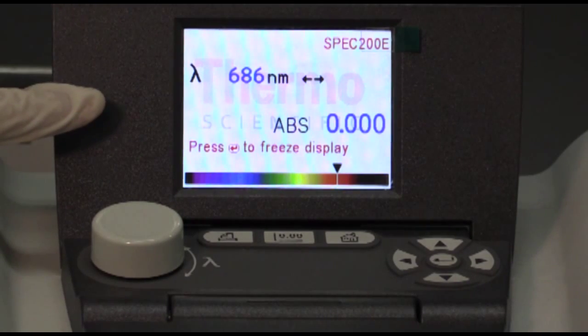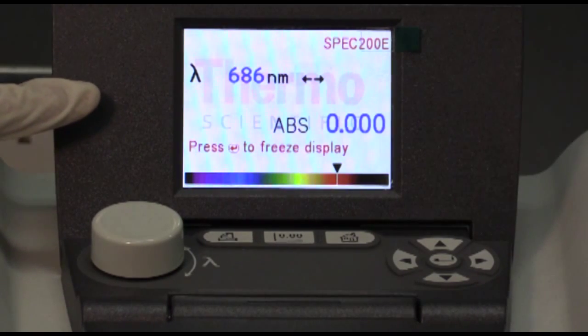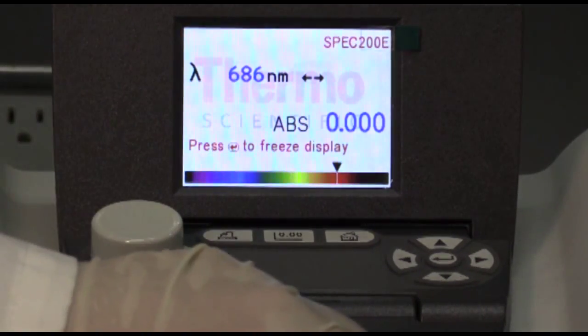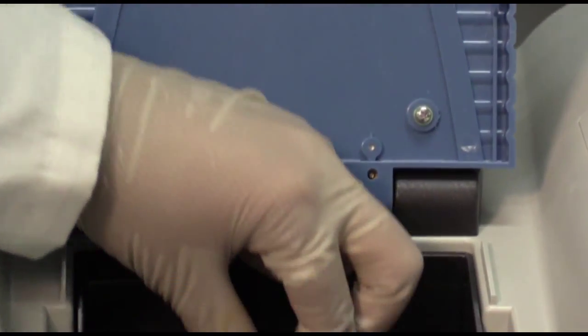Once the display reads 0, and it is flashing, it means the reading is complete. Now you can open the compartment, remove your blank, and put your next sample in.